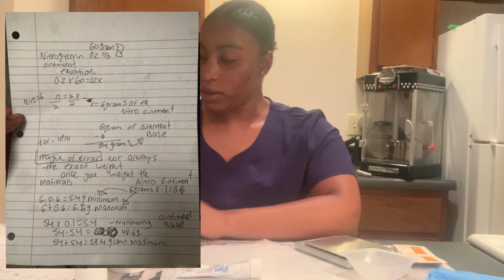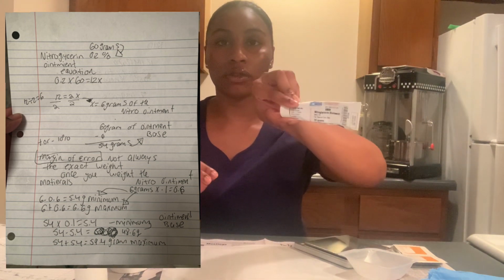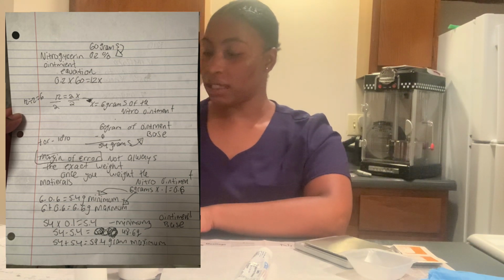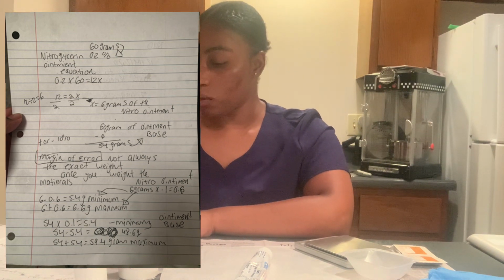So next is the ointment base. Remember, this is the nitroglycerin, and this is the ointment base that we have. With the minimum and maximum allowed, how we'll calculate that is we'll take the 54 grams that we got in the beginning of our ointment base.